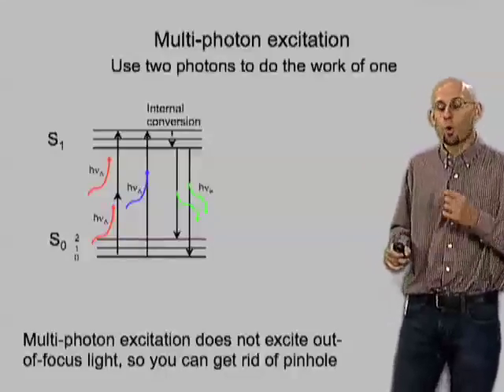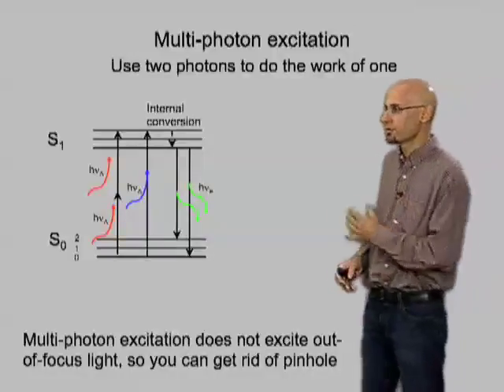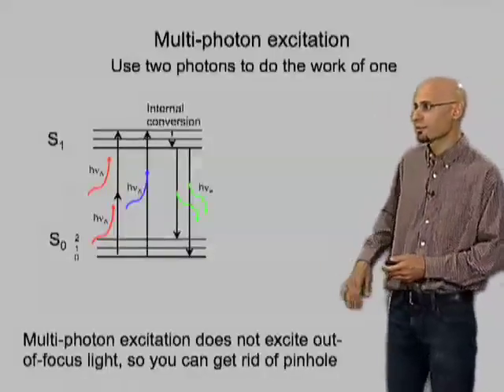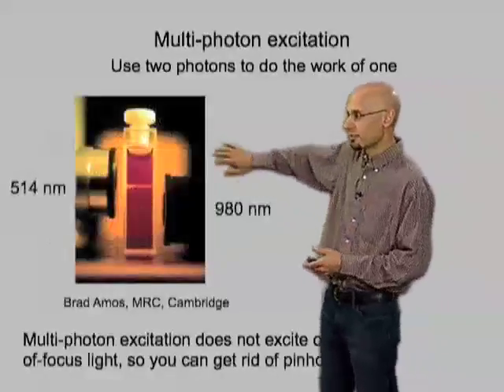And because now you're only getting light from the in-focus spot, there's no out-of-focus light, and so you no longer need a pinhole, and this means that you can become much more efficient at light collection. And so this process turns out to work extremely well for thick samples. Here's an example of this in a cuvette here.